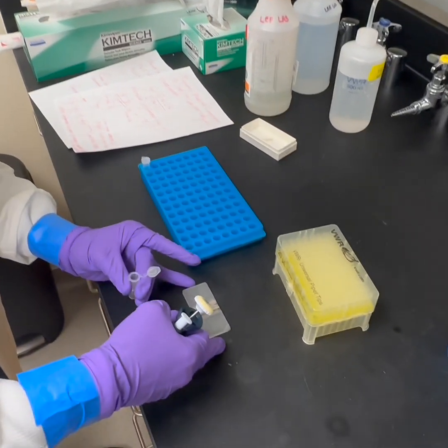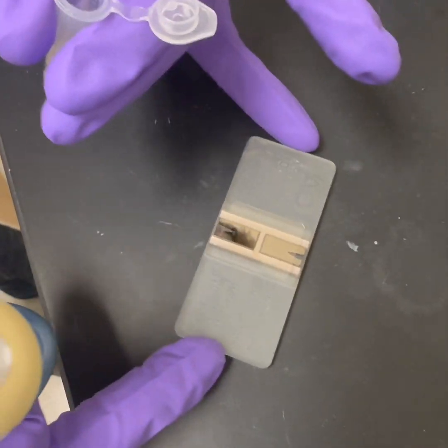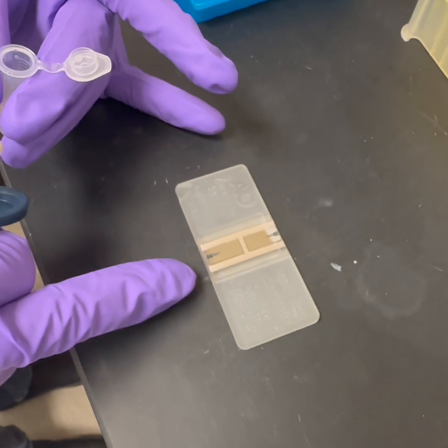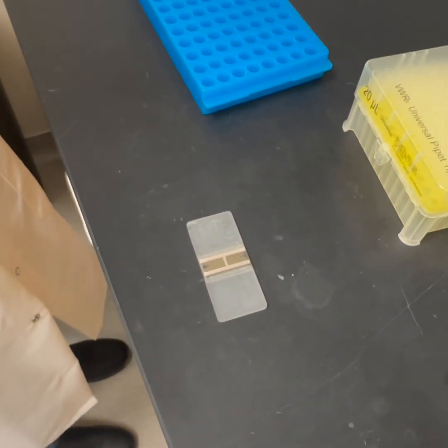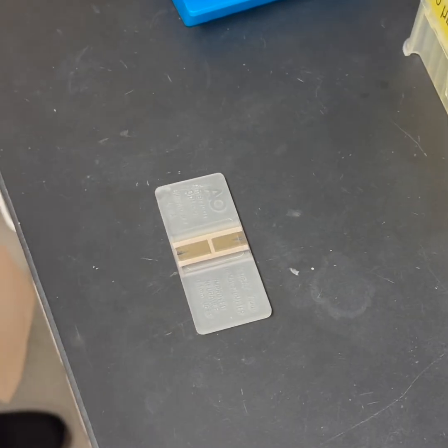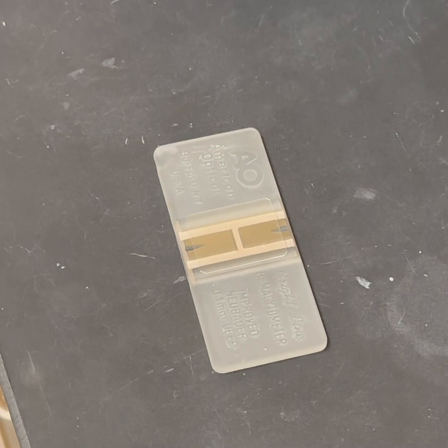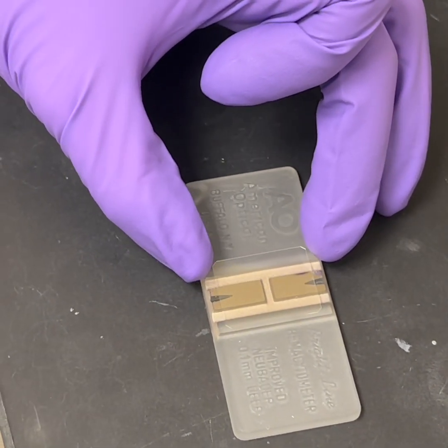You'll see there's notches in this slide. There's a front and a back, and you can count both sides or just one side. Today, for time, we're just going to count one side. It would technically be more accurate if you put some in both. But I'm just going to grab 10 microliters of our mixed solution. And you put the cover slip right here.